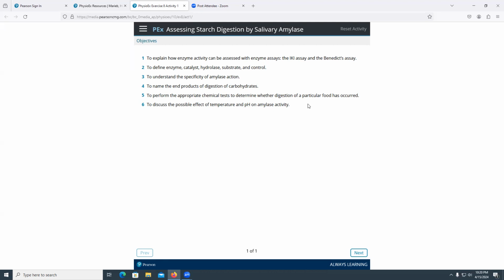And the pH, there's an optimal pH for the amylase to work, and that is usually around the pH of 7, which is found in the mouth. While pH 2 in the stomach is too acidic. That is not optimal and will cause the enzyme to deteriorate, resulting in very low activity, which could be proven by a drop in the products formed.